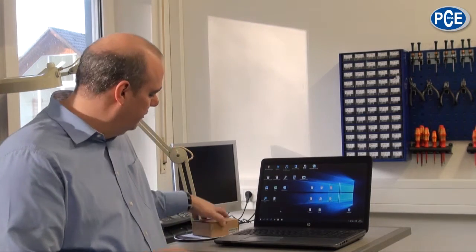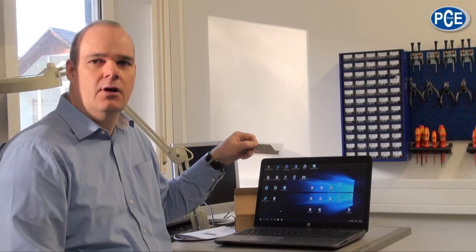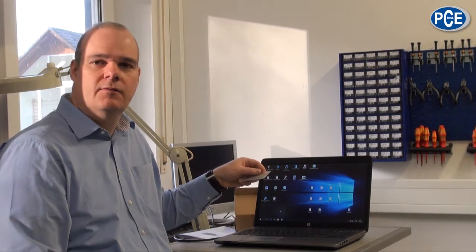It all looks like this. It is a small compact part, not bigger than a credit card. I rip it open and then can put it into my delivery.